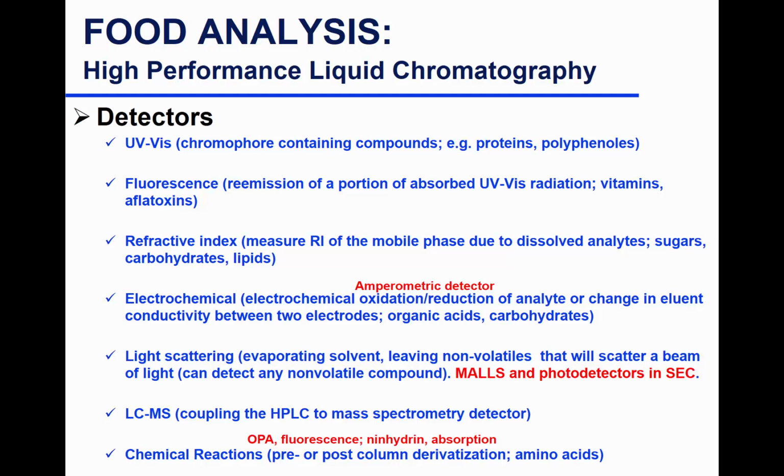And when you change the concentration of the mobile phase, you are changing the refractive index of that mobile phase. So you cannot really read the concentration of your solute when your mobile phase is affecting the refractive index reading. So you cannot have a reference. There are no systems built that allow for multiple references for multiple mobile phase concentrations. It's not on the market.